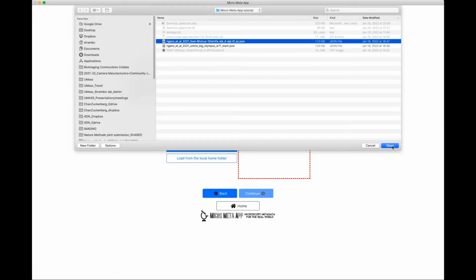Using the AS suffix to distinguish a settings file is a convention that I use, but it is not mandatory. Everybody can use whatever convention they prefer to call their Settings.JSON file. But if you like the way I do it, you can also adopt the same method.